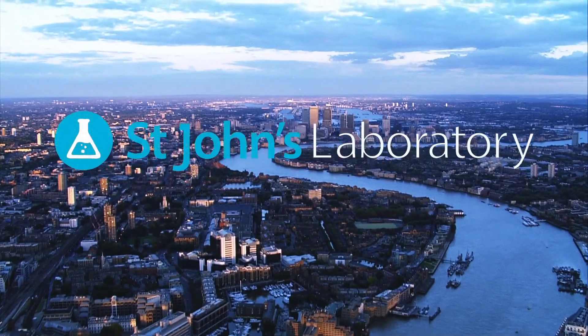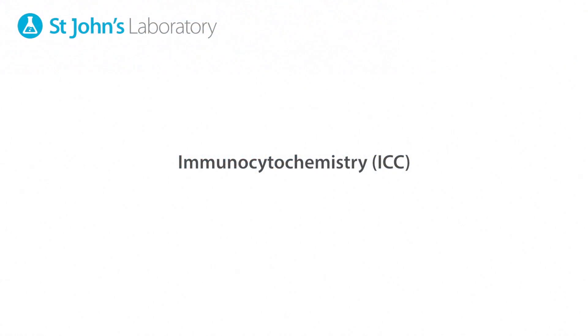Welcome back to St John's Laboratory video protocol series. In this video we take you through a basic immunocytochemistry staining protocol.